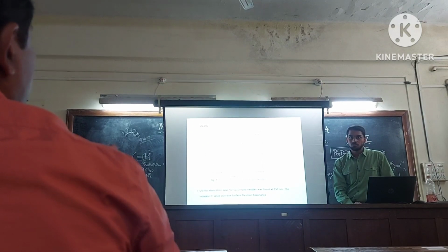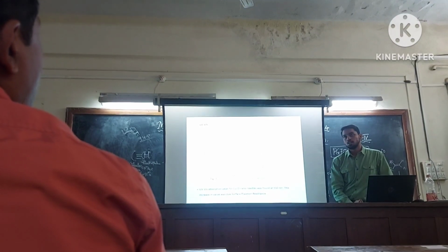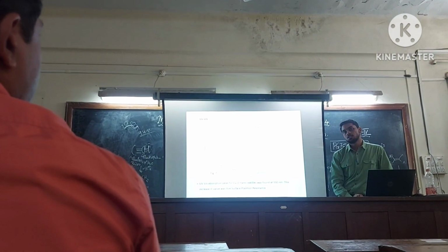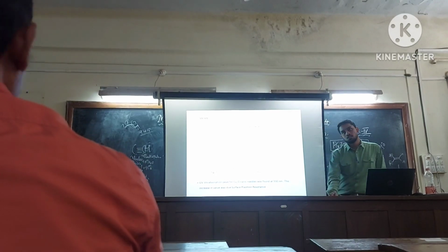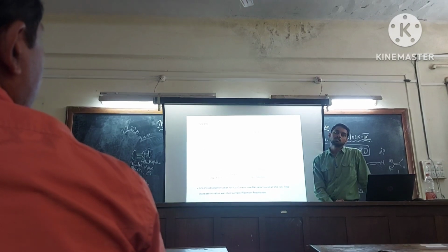They will say now the shifting of this red shift. And this material, this large red shift, copper oxide. It has a standard value of absorption for d-d transitions if you are looking into the UV absorption factors. Now in their case it is getting around 300 something. Now it has shifted to 550.